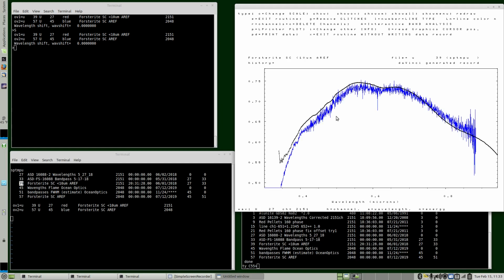And with the ASD spectrometer, using a tungsten lamp, we know the signals are low at the short wavelength end, and often there's an upturn. You'll see that spectra from the ASD and a UV instrument that covers the range with a higher signal and a different lamp, like a deuterium lamp, will diverge here with the ASD spectrum going up. This one's not too bad.